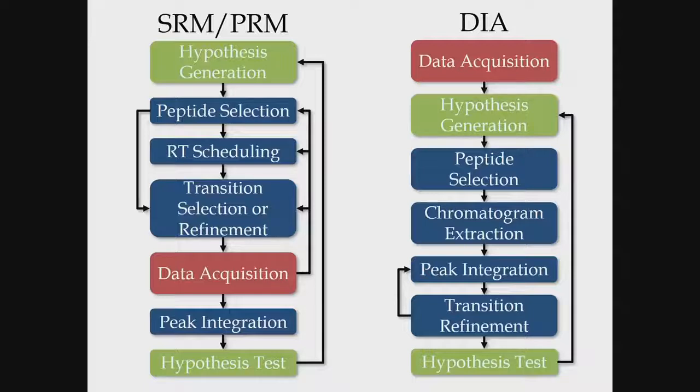We have lots of examples where we've collected data for things, and our collaborators have come back and said, look, is the oxidation on methionine 80 changing during these different conditions, et cetera? There's a brand new paper that shows an alternative splice form, can we detect an alternative splice form that's present in these samples or not?